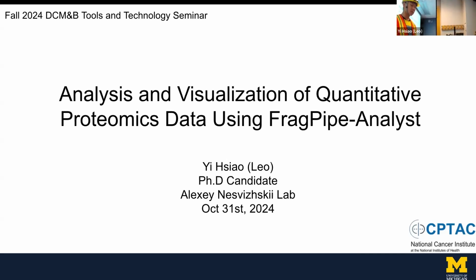Today I'm presenting part of my project recently published. It's called Analysis and Visualization of Quantitative Proteomics Data using FragPipe-Analyst, and I'm currently a fifth year PhD student from the University.